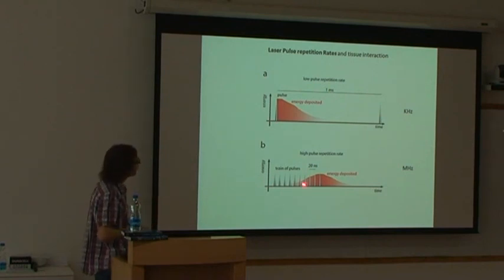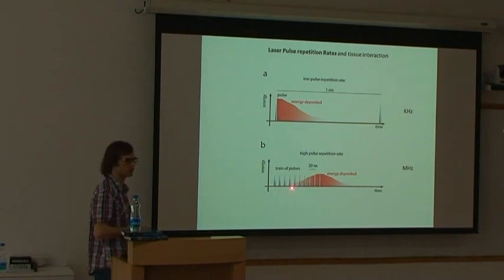If now instead you start to send a train of pulses, the energy which is deposited doesn't have the time to diffuse around the tissue. So this energy will start to increase.